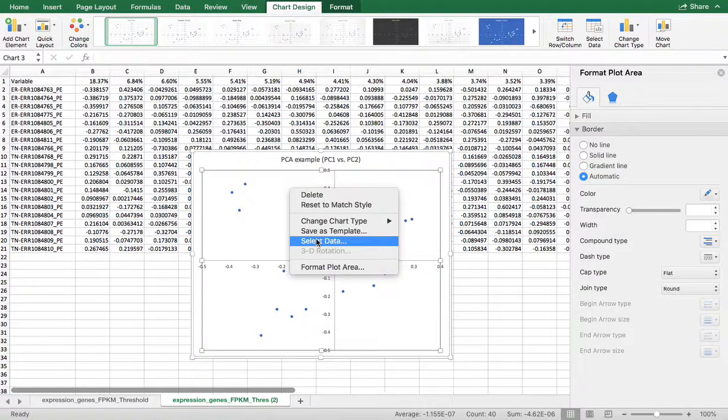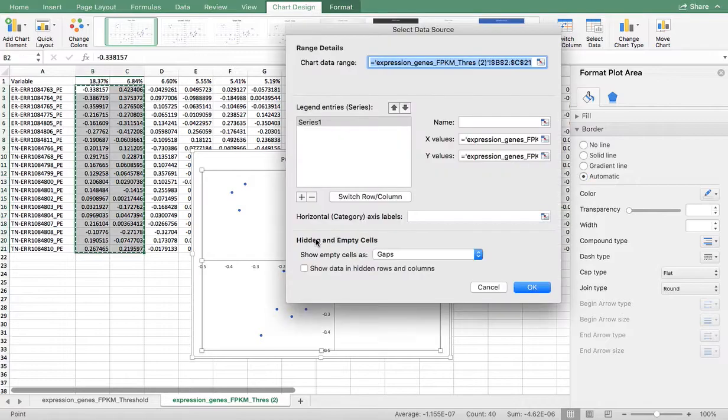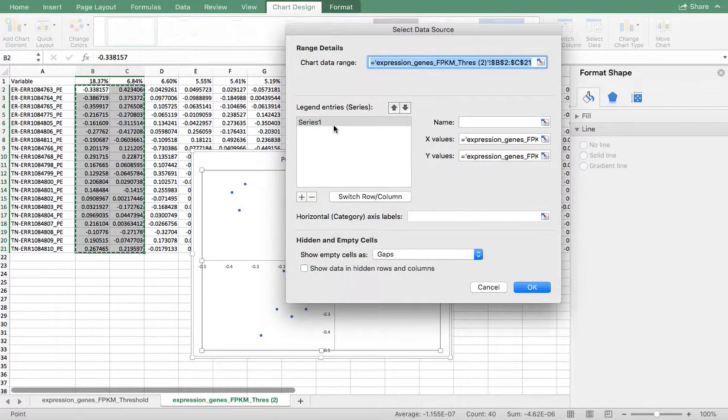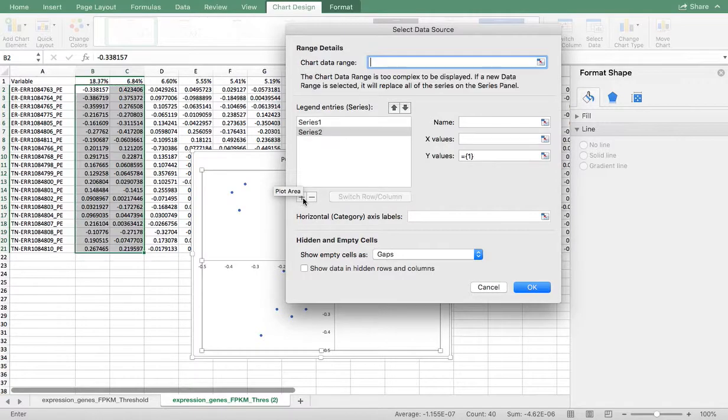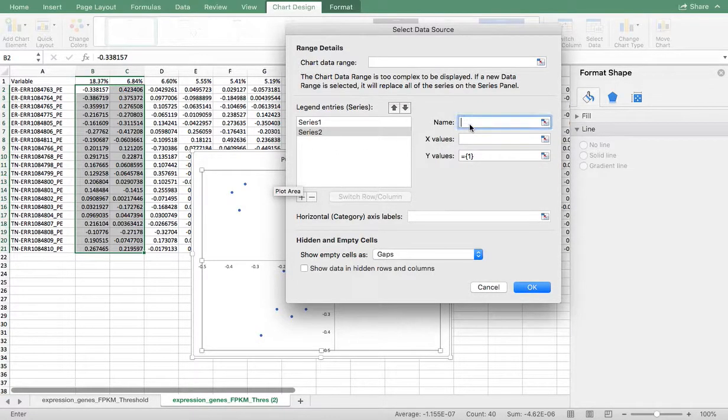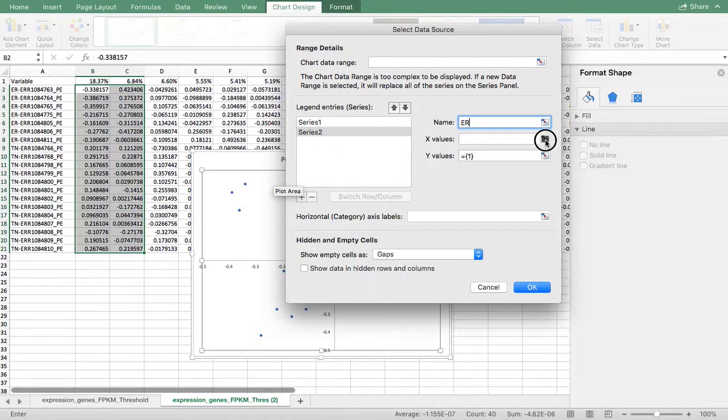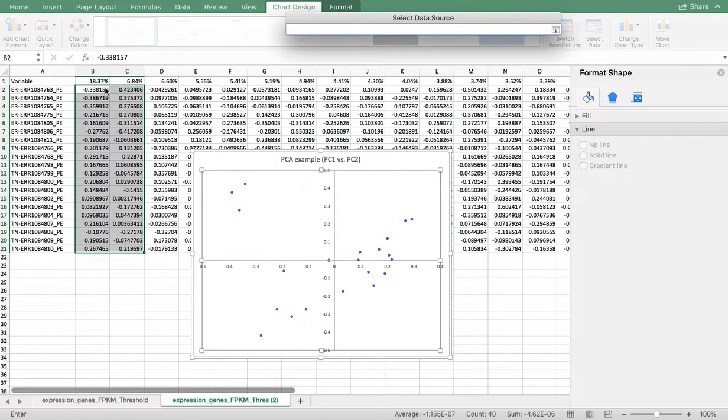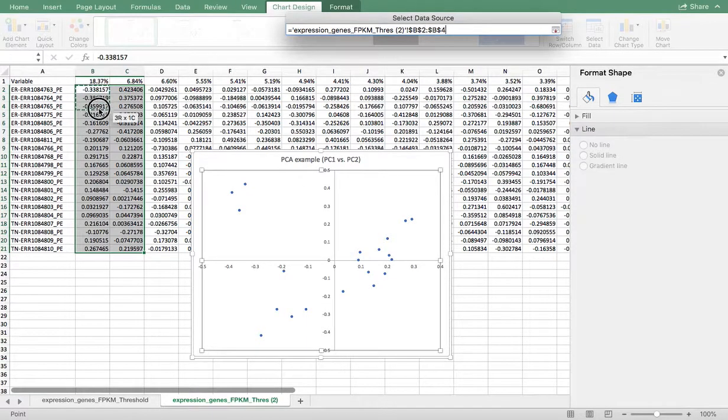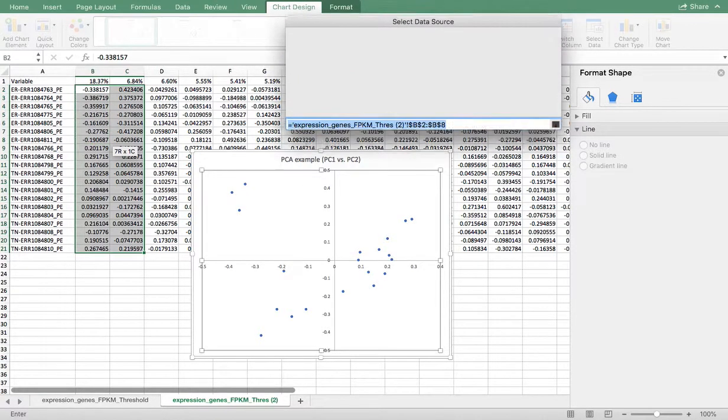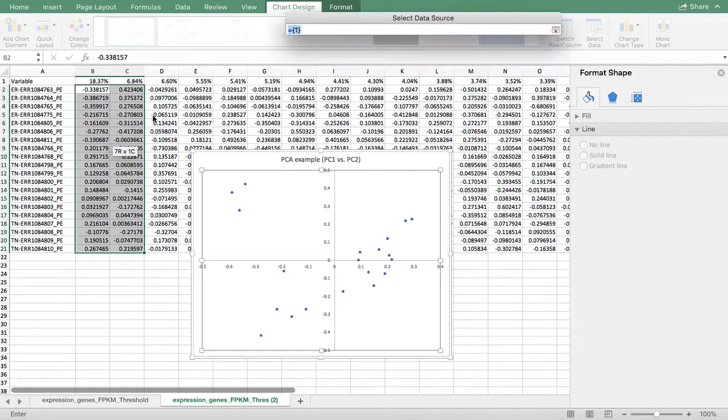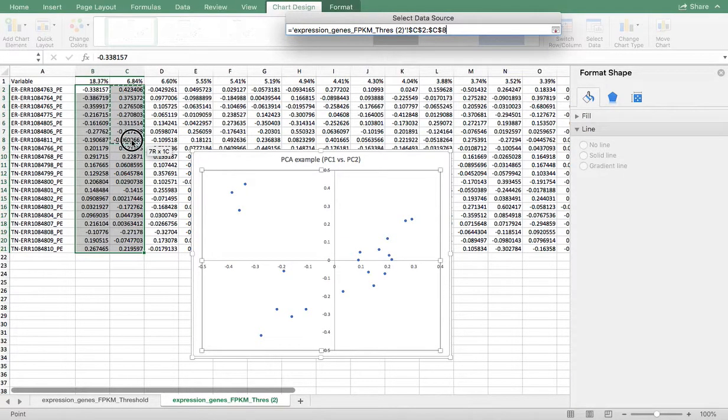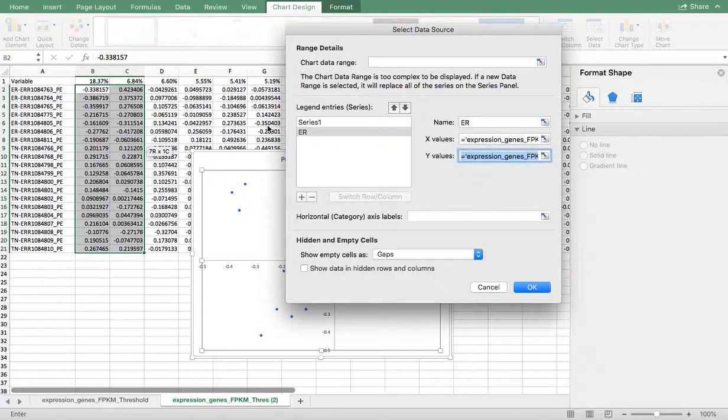Let's go in here and we will go over to Select Data. You can see that all of my stuff is under Series 1. What I'm going to do is add another series and call it ER. I'm going to select the X for ER and then select the Y for ER.